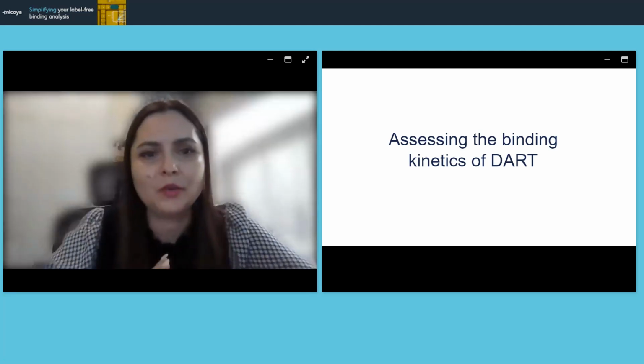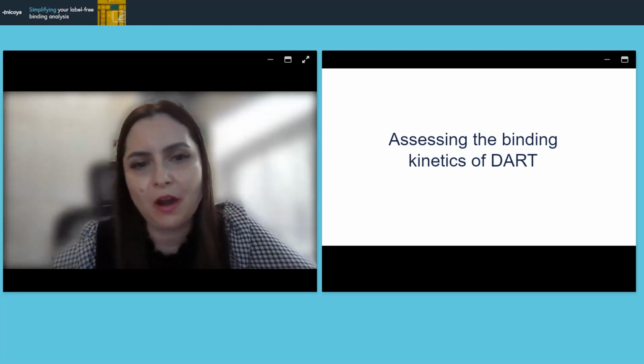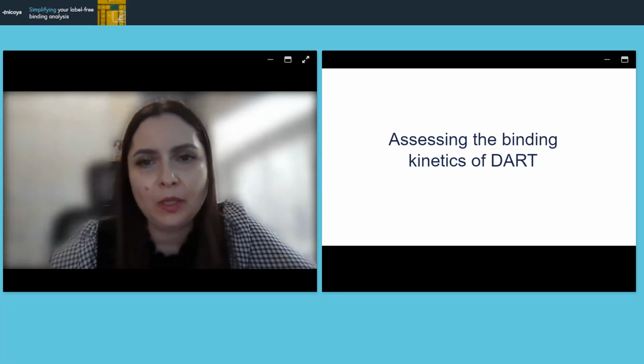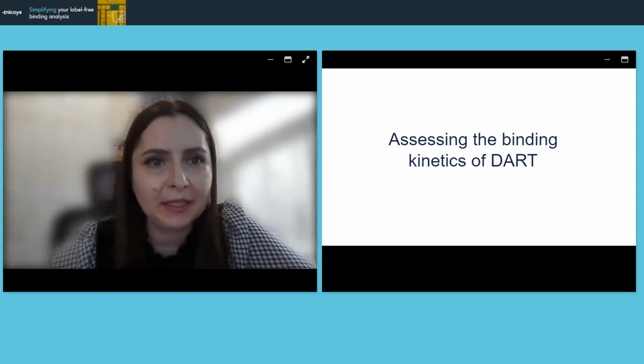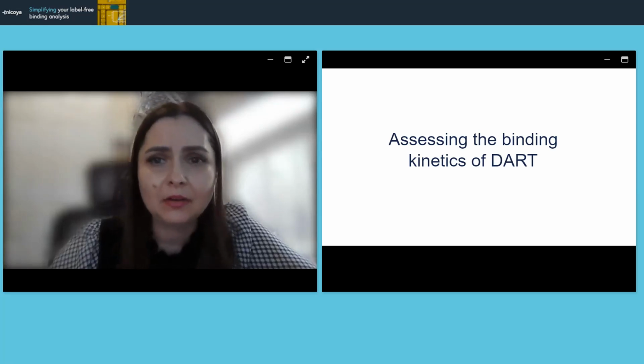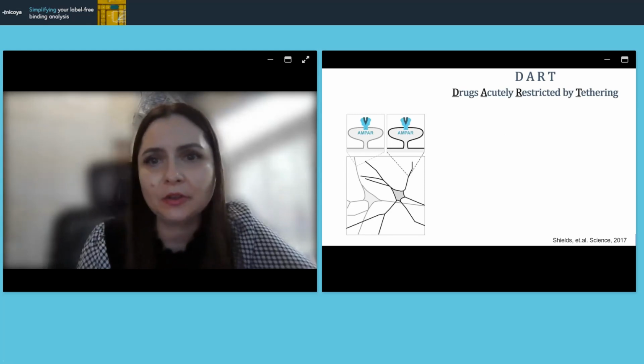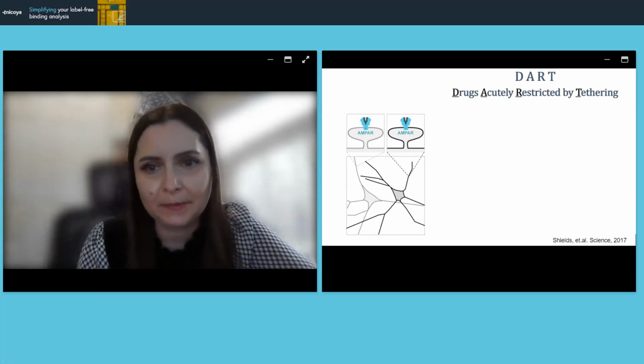I'm going to talk today about our use of Alto in our research and how we utilize it to assess the binding kinetics of DART. And I'm going to start with an introduction to DART. So it stands for Drugs Acutely Restricted by Tethering.